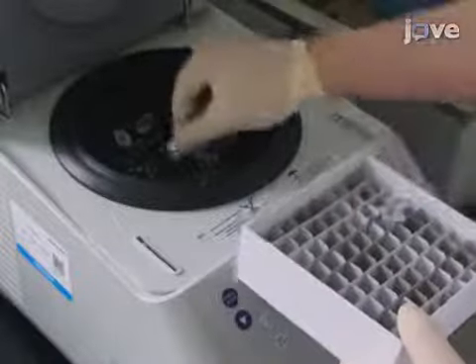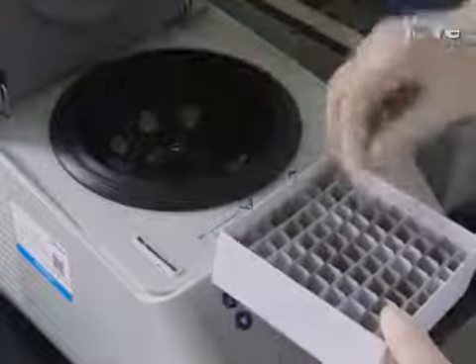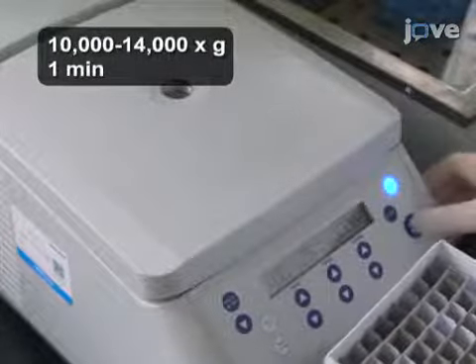After receiving the ordered DNA, spin the tubes containing DNA blocks to ensure that all of the dried DNA is at the bottom of the tube. Then, resuspend the DNA in water.